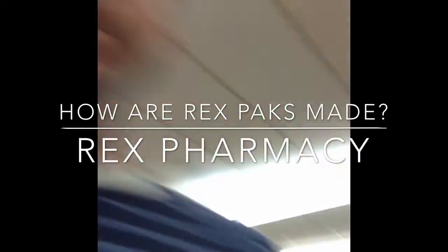Hey guys, it's Frank Grizzo and we're up here at Rex Pharmacy. We've had a lot of questions about Rex Packs and how exactly they work, and if you haven't seen this thing run yet, it's very, very cool. So check this out.